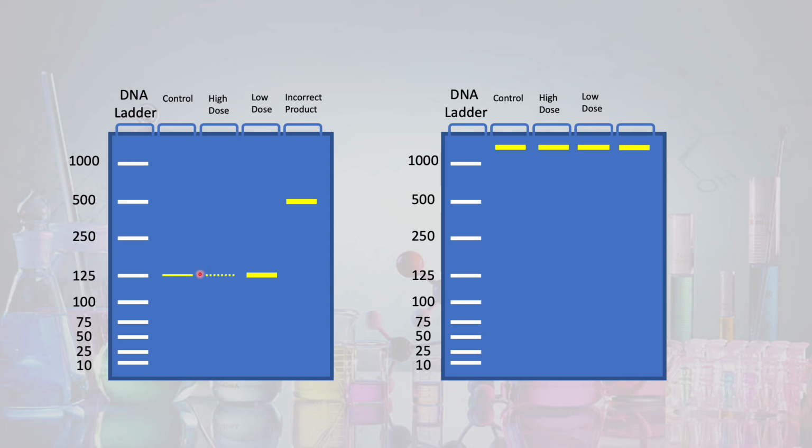So there's one other instance that hopefully is obvious to everyone that may produce a lower amount of mRNA for our gene of interest, right? So this could be in response to the drug that we treated them with. Our drug could literally just be reducing the total amount of mRNA transcribed for a gene of interest, or there's the possibility that our cells are actually dying, and so as cells die, they likely aren't producing as much mRNA. So maybe this isn't necessarily a drug effect so much as our cells are literally dying from our treatment group.